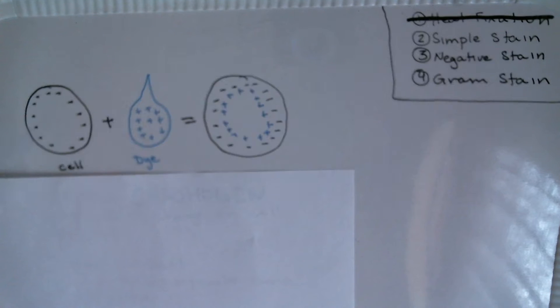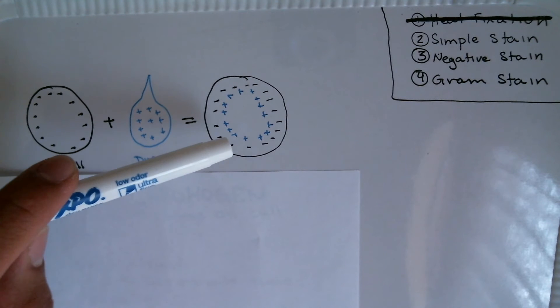Next up, we're going to go over a simple stain. So with our simple stain, the concept is pretty simple: we have a cell here that has a negative charge, and we mix it with a dye that has a positive charge.